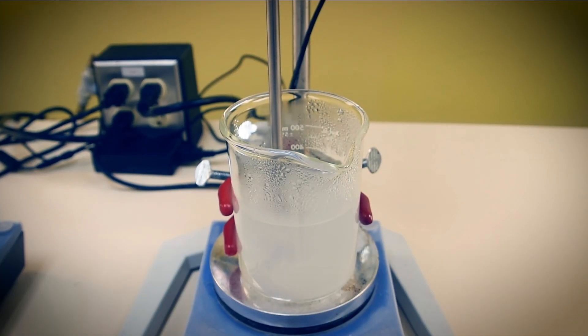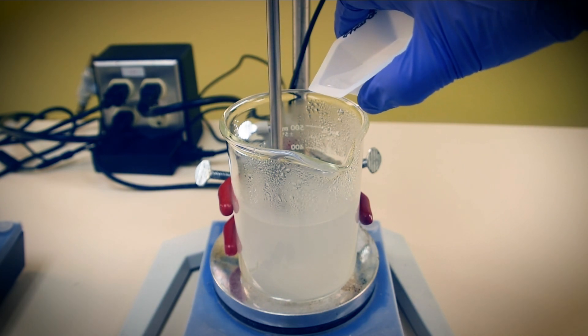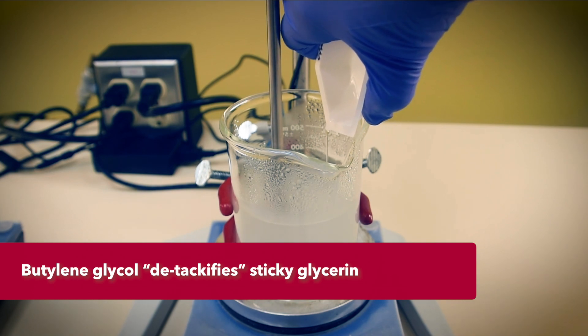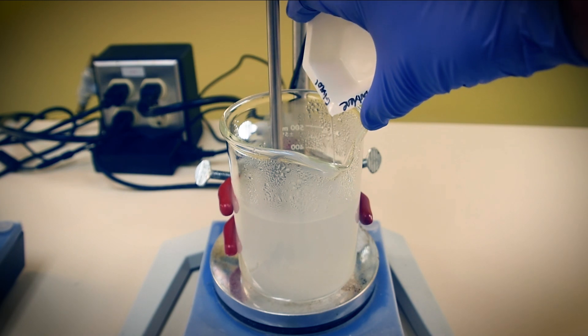Now we'll add to our water phase both glycerin and butylene glycol. Glycerin is a humectant that retains moisture on the skin, and butylene glycol retards tackiness from glycerin and other sticky liquids like honey or aloe vera gel. Butylene glycol is also a good dermal penetrant vehicle.